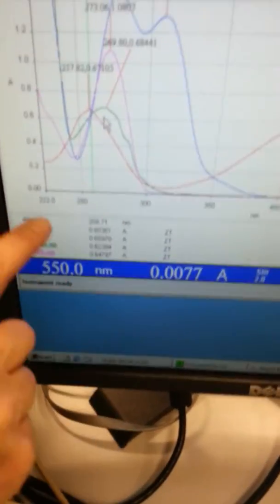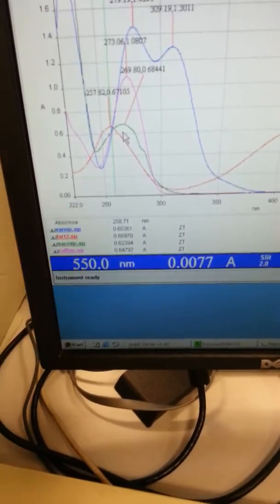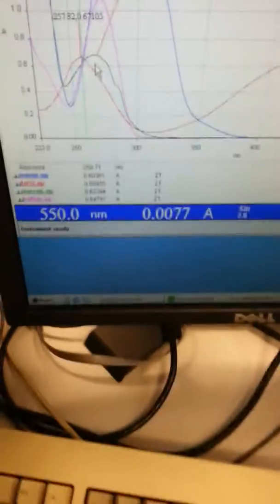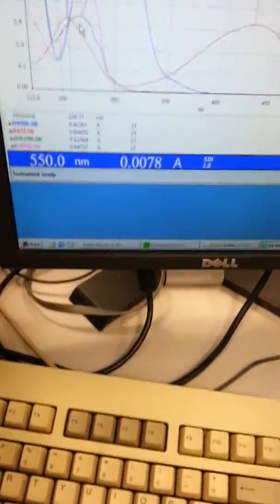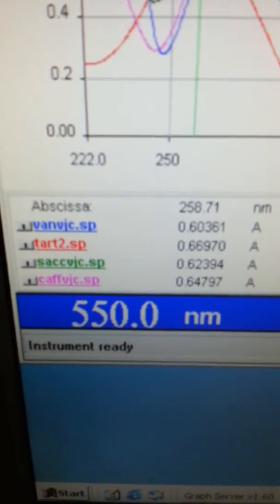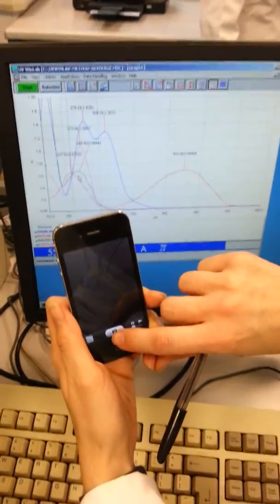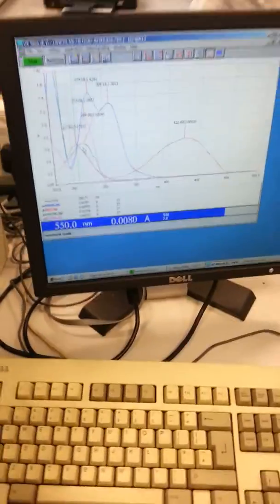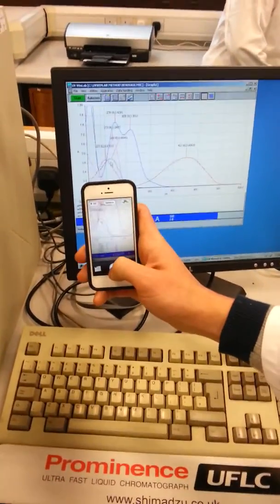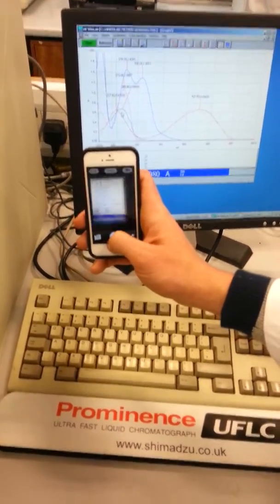You want the chosen wavelength, and the absorbance of each of the compounds at that wavelength. And how accurate can you go? There's no 100%. You're actually asking a good question about precision. Sometimes that's the best you can get with this. What you would ideally want is a flat region for all 4 compounds, but we haven't got that with these. In these synthetic analgesics or the opiate analgesics, we've got more of a flat region rather than a steep slope. So then we want to put the absorbance for each of these in at that wavelength.